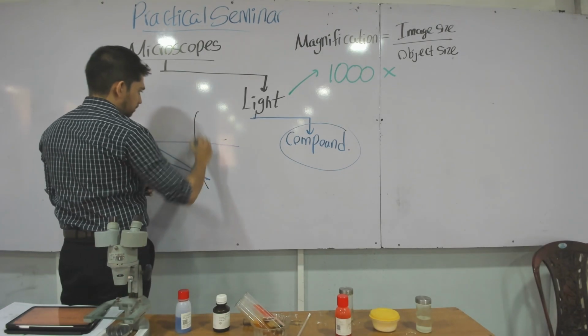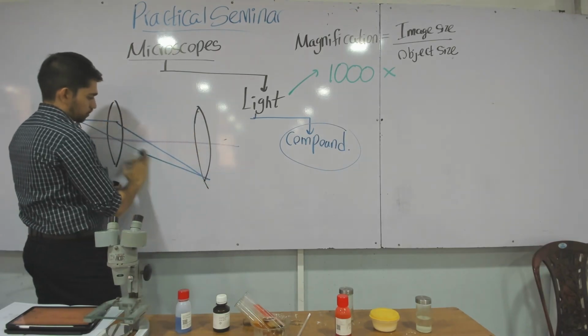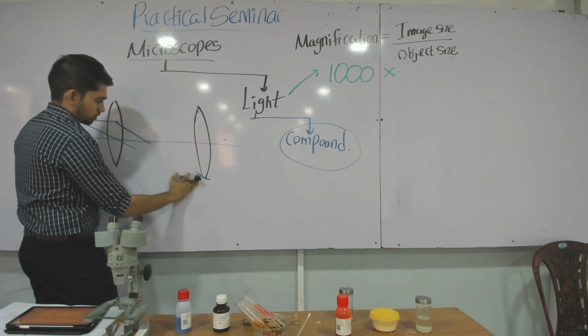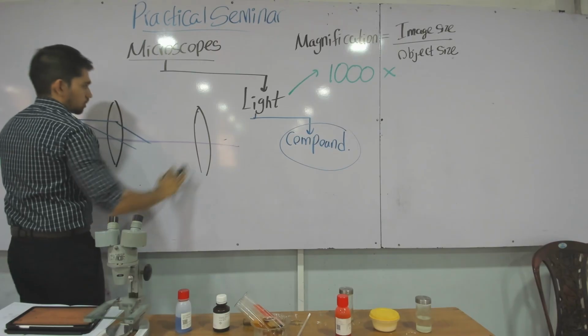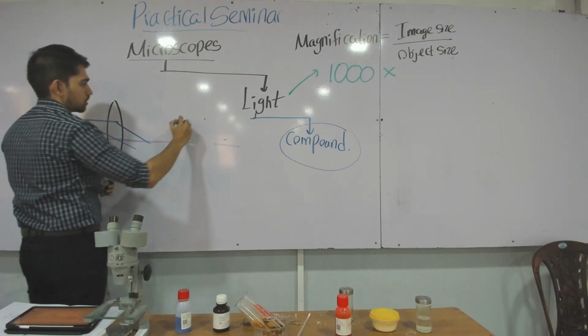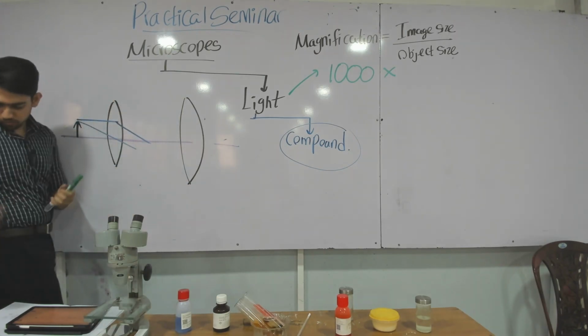It's not physically that big to draw a proper lens diagram, so I'll make it a bit big. I can't exactly remember how these lens diagrams are. I am not doing physics. I have not studied physics for 5 years.